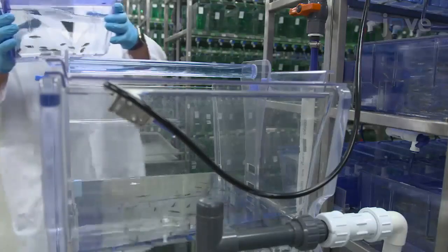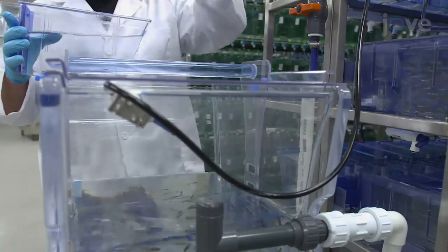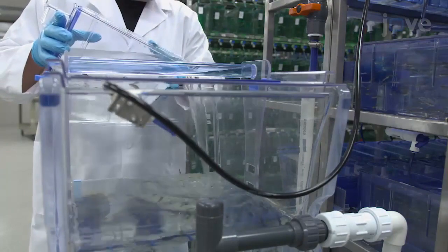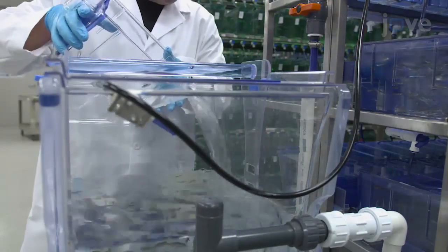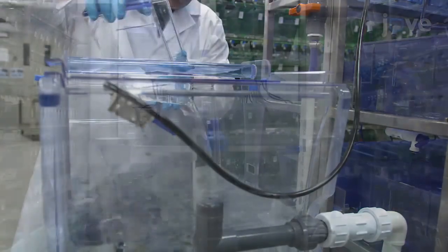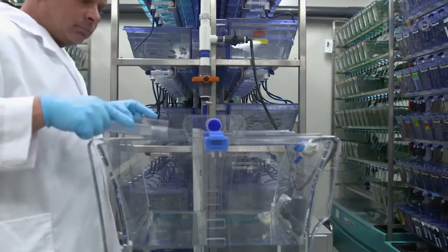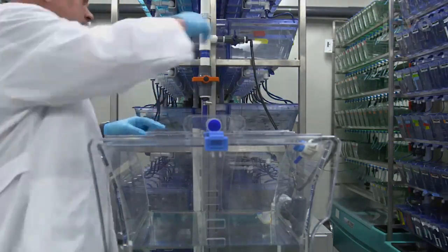For breeding strategy number 2, combine dozens of male and female zebrafish in a large breeding tank. Use this strategy as long as there are a sufficiently large number of embryos. It is reasonable to assume they came from a variety of founders and are therefore genetically representative of the population.